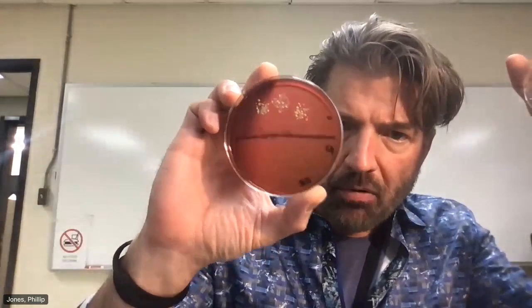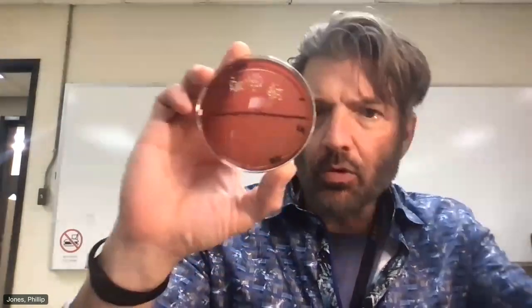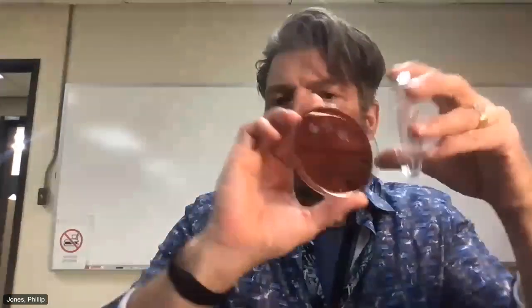If you look at this, there's some yellow raised colonies — that's definitely Staph aureus. I'll Gram stain that later. And it looks like there might be some E. coli on there; there's a bunch of different stuff on there. Really perfect morphology, and I should be able to isolate certain colonies off there with the loop and figure out what that is — maybe make some slides and record that.